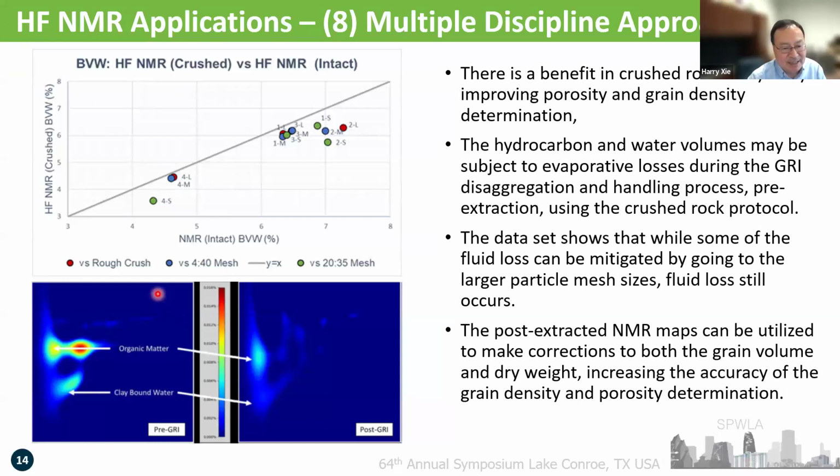So you have tight rock samples, you crush them into certain sizes, and then you go through the so-called Dean Stark extraction, trying to remove all the oil and the water, and then you do the analysis to calculate the saturations. But with some samples after Dean Stark, you can see you still have some residual liquids in the sample. Some are more, some less.